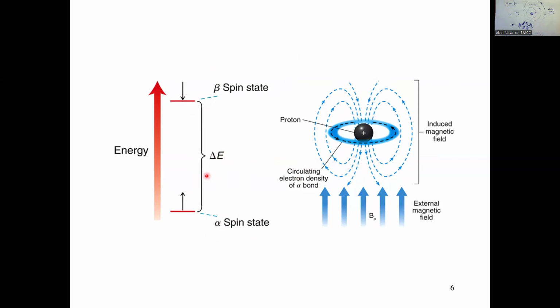Okay, so it's really that point. The most important part of the instrument is the magnet. The magnet is what allows me to distinguish between hydrogens. This part is simple. It's just like ground state to excited state, relaxes, and then emits, right? So that's the conventional spectroscopy. This one is not a spectroscopy. There is no spectroscopy here, but we need to do this for us to see that response.